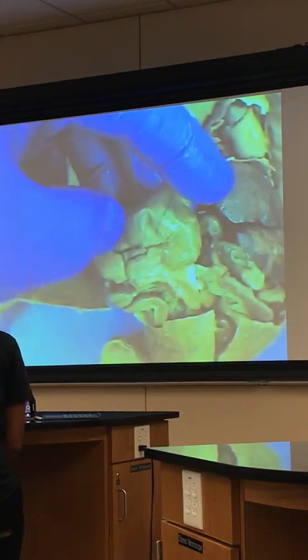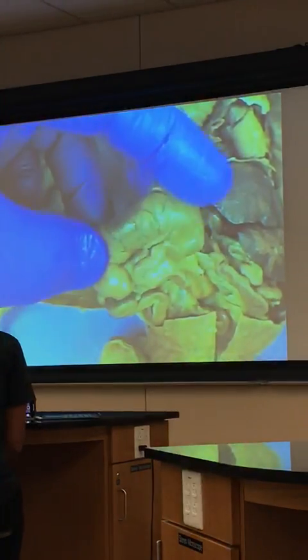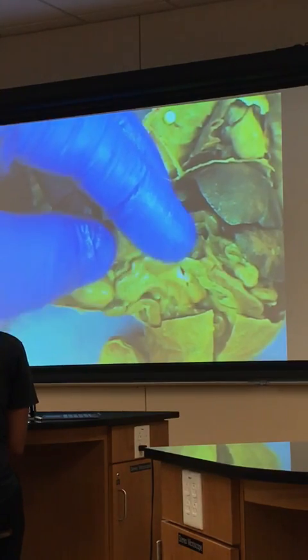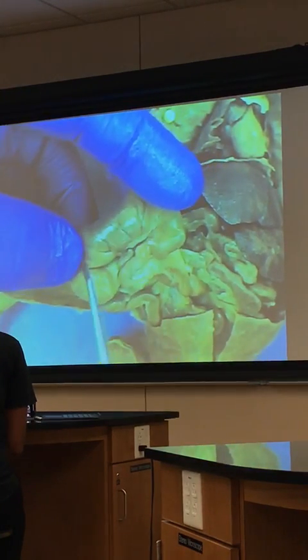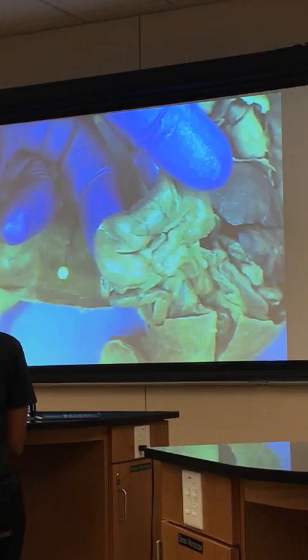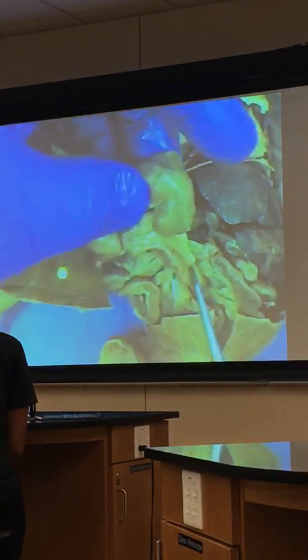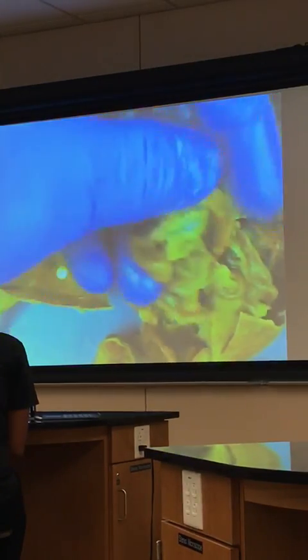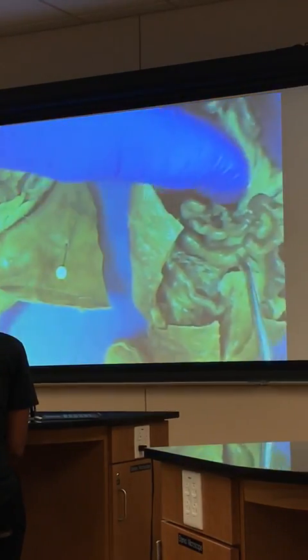The large intestine, this structure right here, make sure that you look for the bearings on there before you put an answer down. So if you see something that looks like this, this is the cecum. Okay, this is the cecum. Here is the large intestines right here, and this rat's guts are just kind of all mangled in there. But here you can see the large intestines.